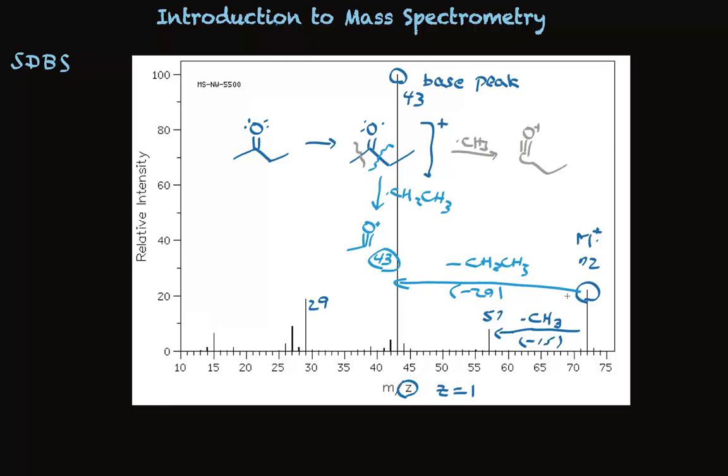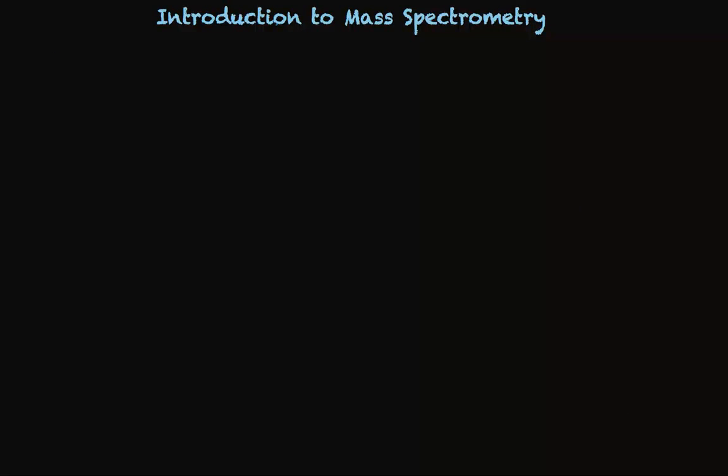So it's a way of essentially using, like a fingerprint, the pattern of the mass spectrum to positively identify an exact structure if you have a mass spectrum of a known structure for comparison purposes. Very powerful. Let's quickly take a look at a couple other cases.